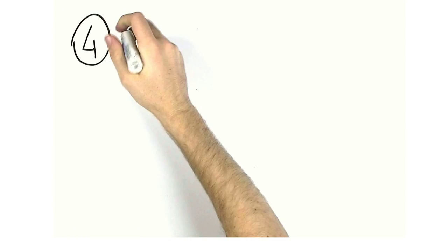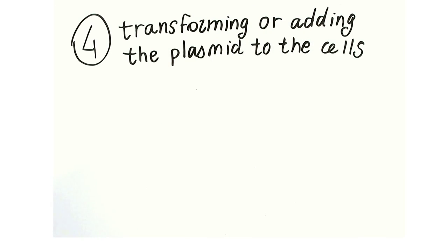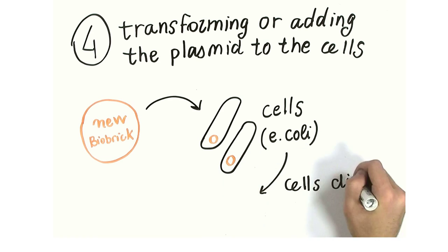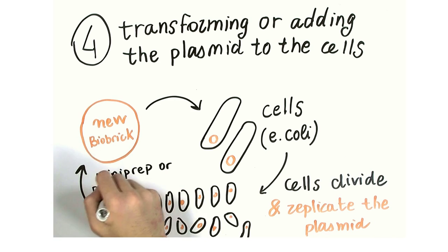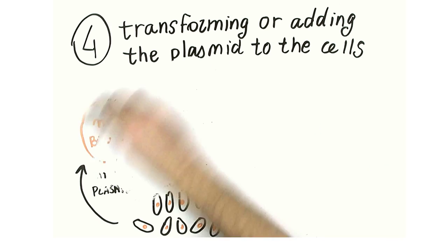4. Transforming, or adding the plasmid to the cell. After ligating your gene of interest into the plasmid backbone, you can transform the circular plasmid into your cell. The cell can replicate and make more of your DNA. In order to get back your plasmid, you can culture your cells, making sure that you use the correct antibiotic so that only the cells that have your plasmid grow, and mini-prep or extract the plasmid from the cells.